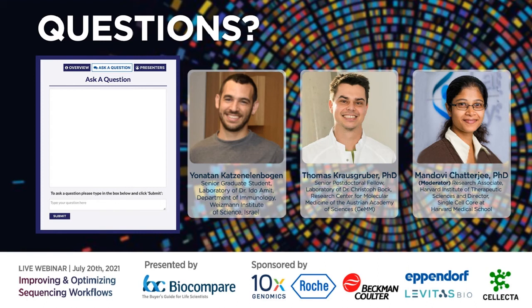This is one thing. And regarding the rare populations, some dissociation protocols tend to enrich or deplete different subpopulations. It's very hard to benchmark it, but it's something you need to consider. When we start a new project with a new tissue, we usually collect many dissociation protocols and we compare between them, and we try to see which dissociation protocol gives us the highest heterogeneity of the tissue. When you want to target rare populations, it's highly important.